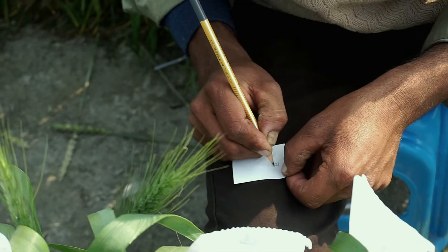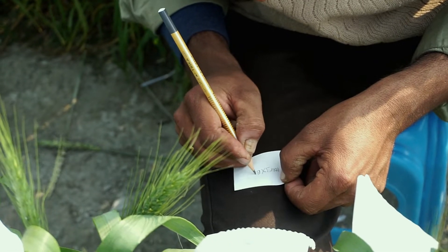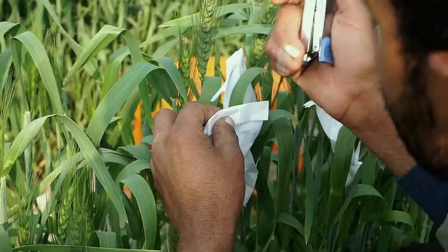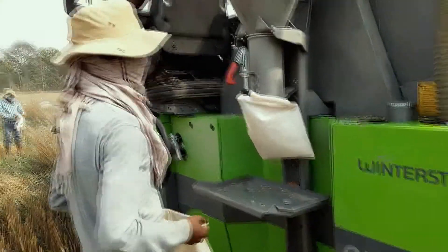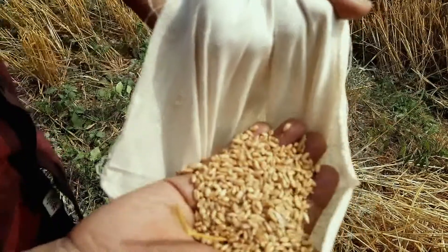After dusting, put a tag mentioning the cross name, date of crossing, and name of person inside the bag and seal it properly. At maturity, seeds are collected and stored separately for each cross. This seed is a hybrid seed.